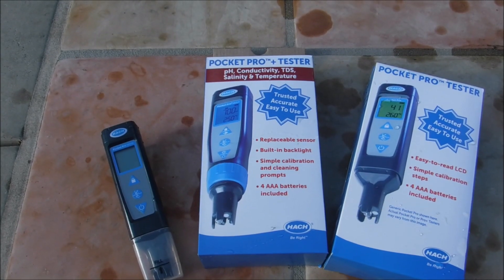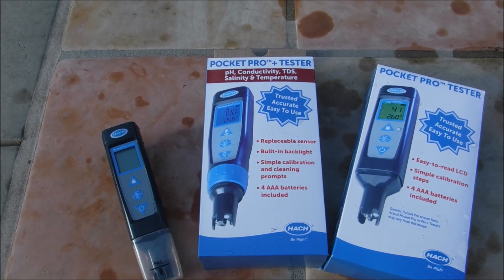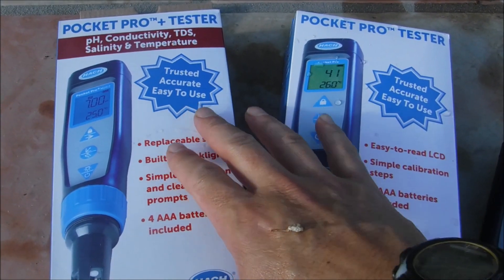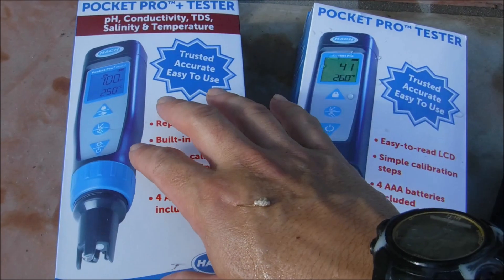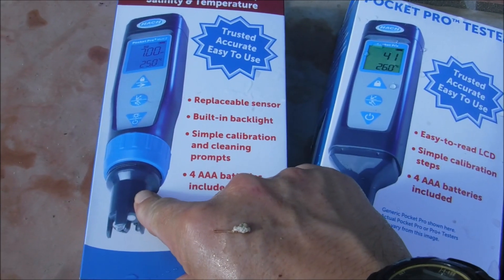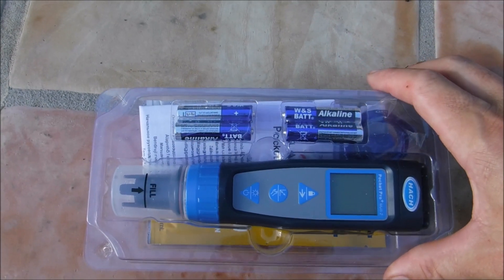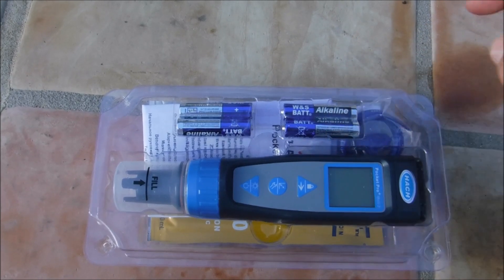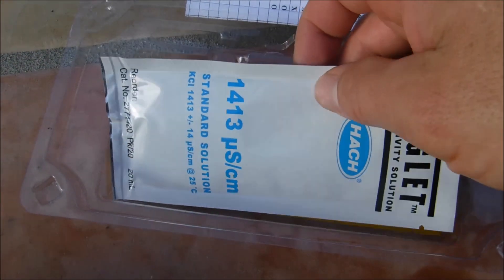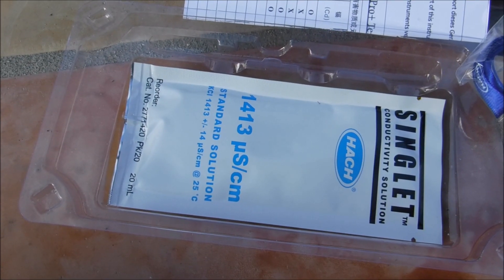I'm going to give you a quick overview of the Hawk Pocket Pro and Pocket Pro Plus testers. The difference between the Pocket Pro Plus and the Pocket Pro is that the Pocket Pro Plus has a backlit screen. Also, the sensor is replaceable. Another advantage of the Pocket Pro testers is that they use AAA batteries. The Pocket Pro testers also come with a solution to calibrate the testers, and you can order more of these packs to keep your testers calibrated.